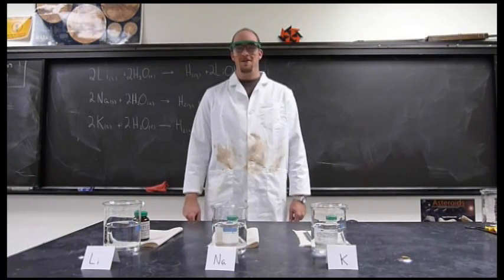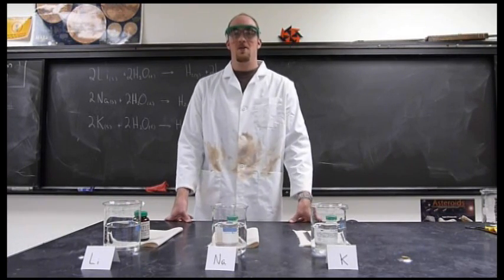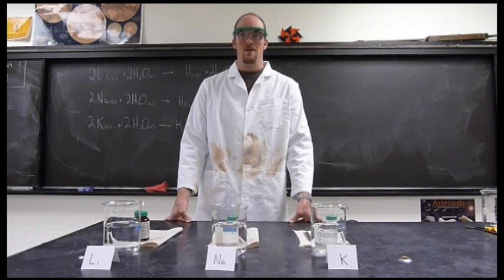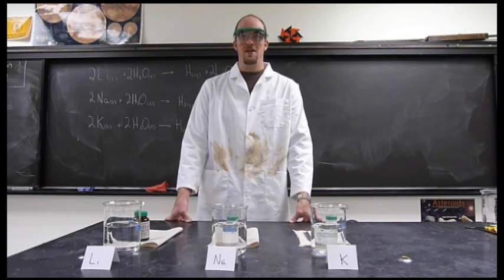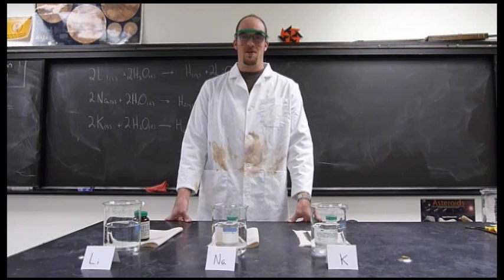Hi, Jim Ed. Today I'm going to be showing you some reactions with alkali metals, specifically the alkali metals lithium, sodium, and potassium.